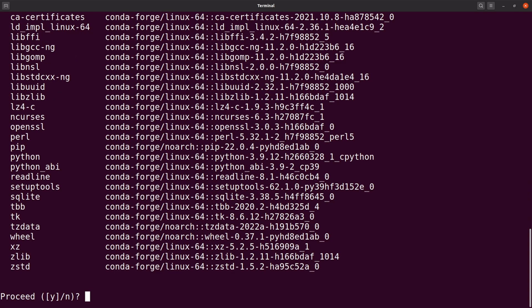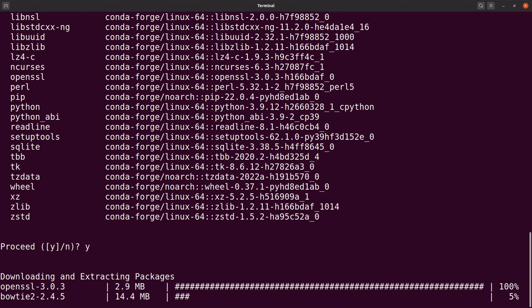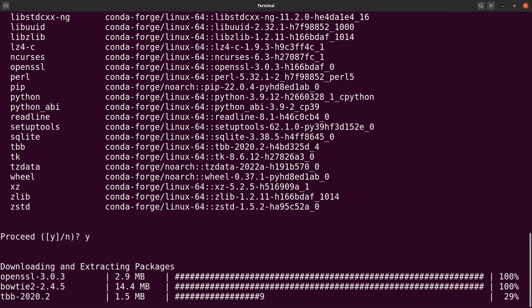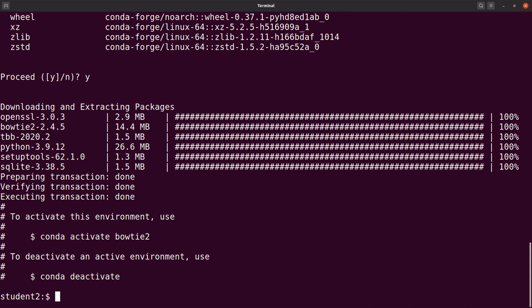Type y to confirm and then hit the enter key. Conda will download all the required dependencies and packages and then install them, and finally install Bowtie2 as well. Bowtie2 has been installed successfully. Even though it has been installed, if you want to run it, you need to first activate it. So let's clear the screen and then activate the environment and test Bowtie2.